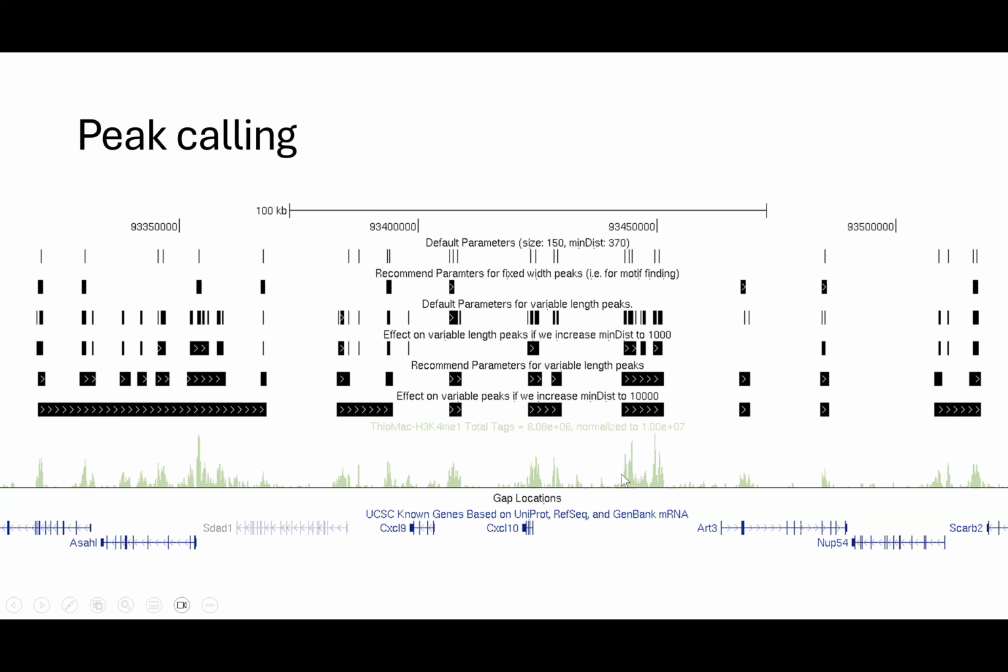And then this grouping, it's hard to say, is that two, or three, or one? I think it's not well defined what the best answer is, but it's good to keep in mind that this will affect your downstream results.